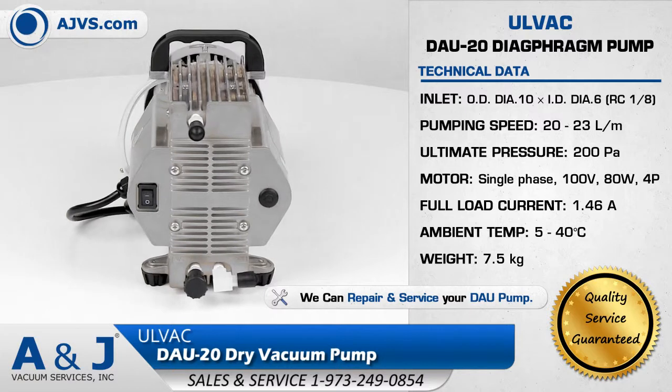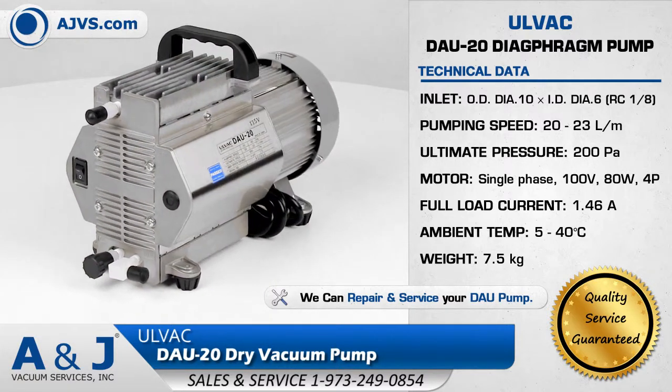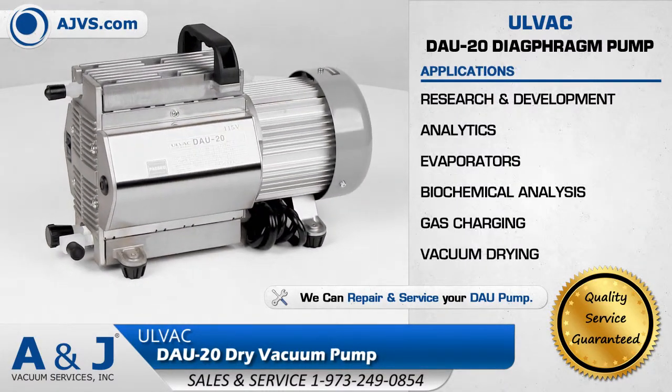The Olvac DAU Diaphragm Pump Series is a highly reliable and low maintenance high vacuum solution for applications in research and development, analytics, and leak detection.